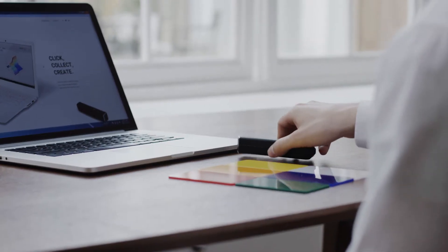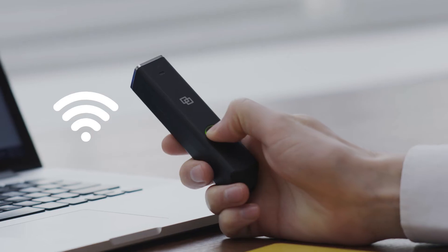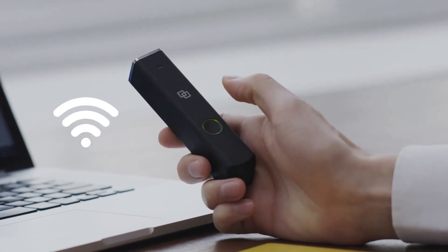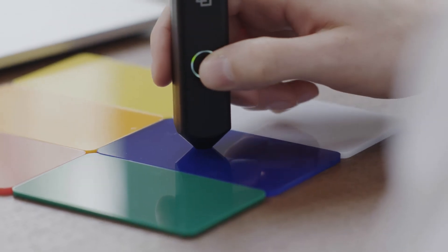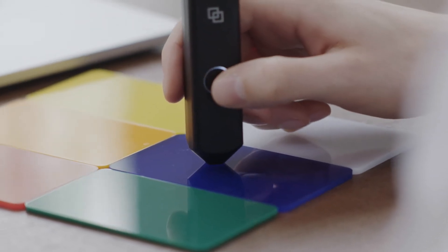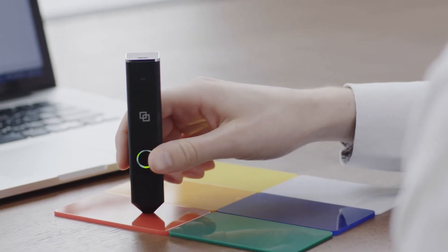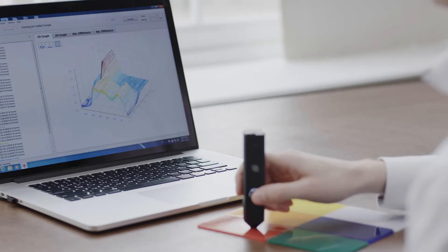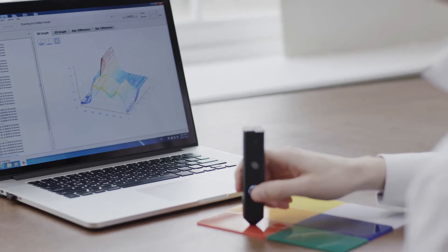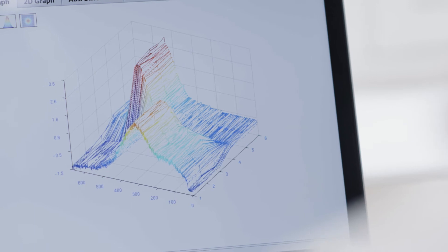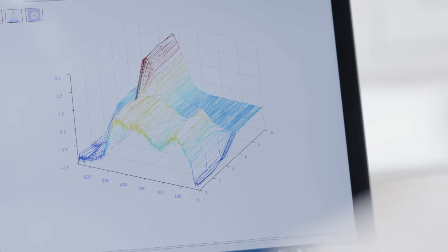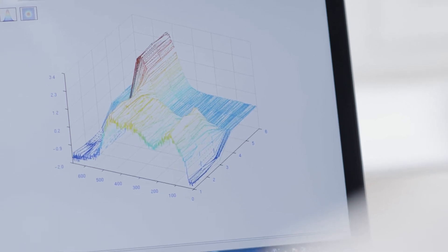Connect LinkSquare to a Windows PC using Wi-Fi. Next, place the LinkSquare in contact with the object of interest. Then press the button on the side of the spectrometer. LinkSquare will gather data on how the object responds to light and transform the data into a spectrum graph.